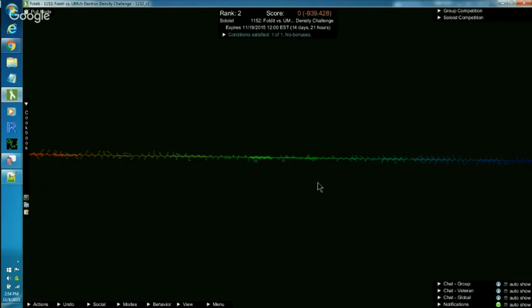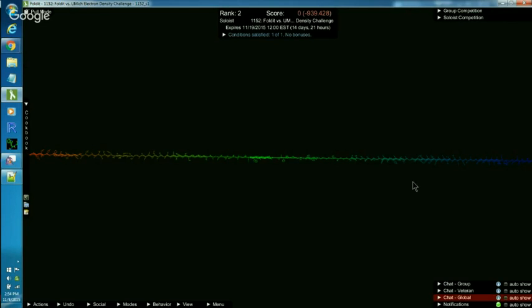We are looking at puzzle number 1152. This is the extended chain that we were given at the beginning of the puzzle. And the only thing I've done to it is to shake it.